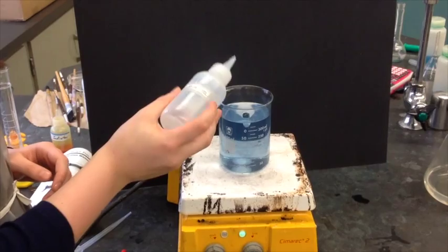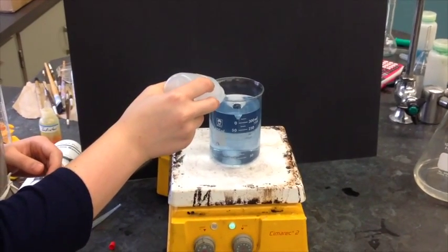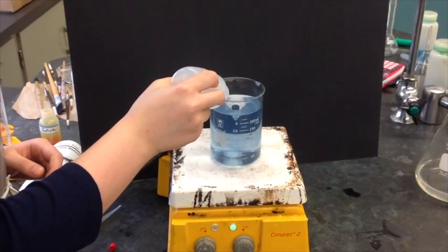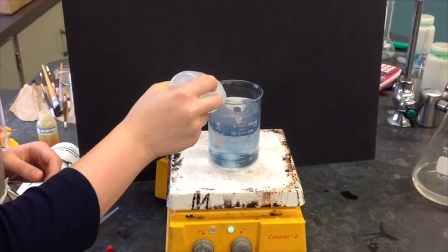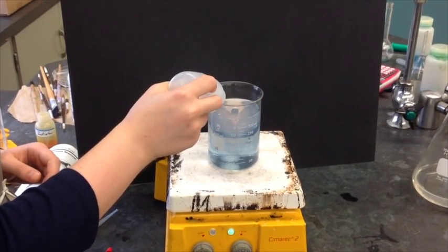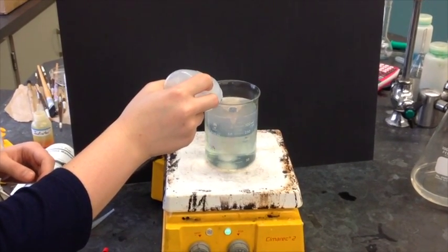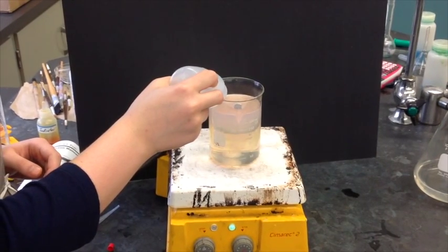Ready to learn something cool about pH? The pH at which the net charge on a protein is zero is referred to as the isoelectric point. Most proteins have their minimum solubility in solutions at their isoelectric pH. This is at the point at which the maximum cloudiness occurs and the precipitation of casein, which you have just watched in this demo.